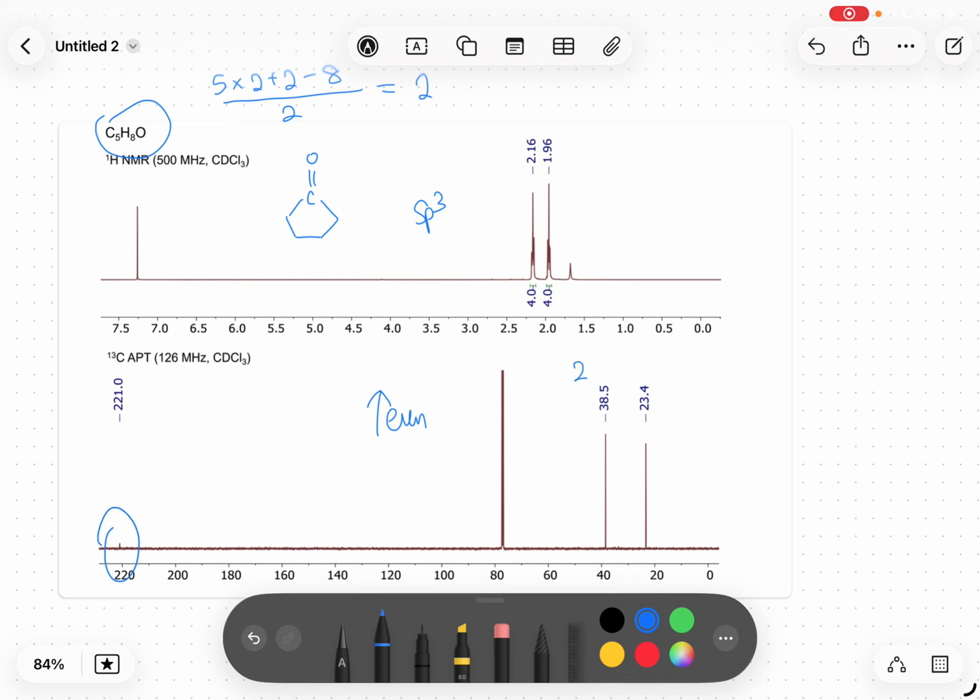Well, this one is a small peak because it corresponds to this carbon, which doesn't have any hydrogens attached. Of course, this isn't a hard and fast rule, so expect exceptions. But usually it works. So that's something that might be quite handy to you when you see more complicated spectra.